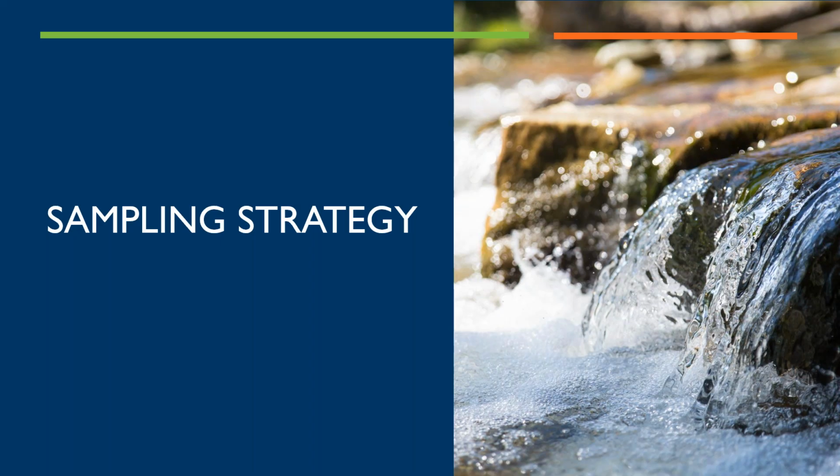So all of that sets up for our next stage. The next stage, of course, is the sampling strategy. And all of these individual things, from assay selection to sampling strategy, all the way down to data interpretation, are very important to keep in mind in the beginning stages of determining what to do next. So I'm going to pass the mic over to Kate. Kate, as many of you know, is our amazing technical director here at Microbial Insights. She's going to talk you through different forms of sampling strategy and how to move forward with your project on that front. So here's Kate.